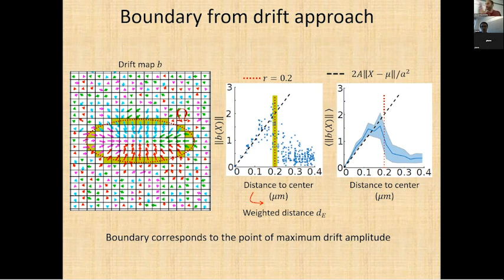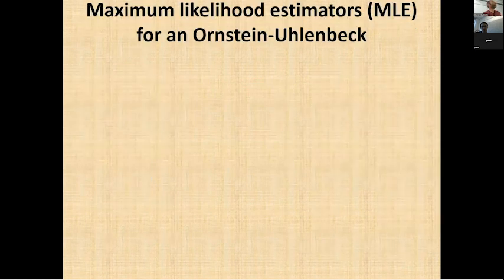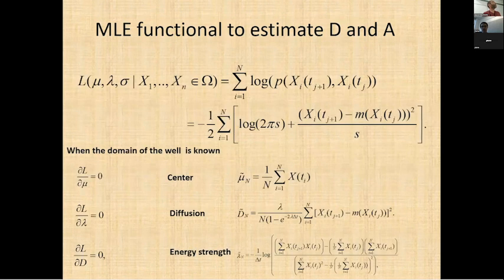Before doing all these exercises on Imaj, I think it was important to explain to you the essence of those algorithms, where things are coming from. Okay, so again, I'm not going to show you all of this math.